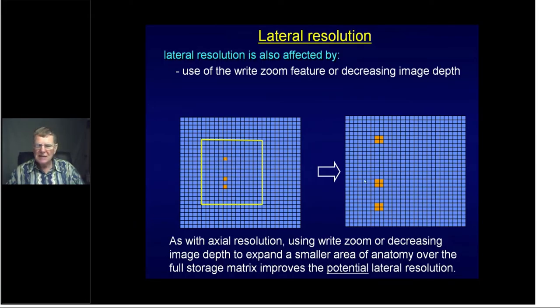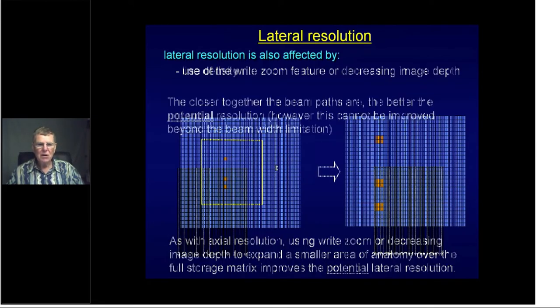You're expanding this over this small area. You're improving your pixel resolution, and it will improve the potential lateral resolution. But my broken record has started again. You can never get better than your beam width geometry. Okay, so that's worth keeping in mind.